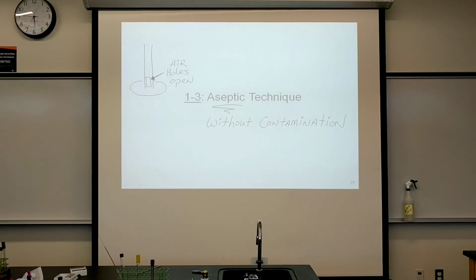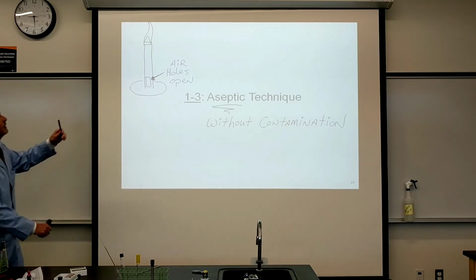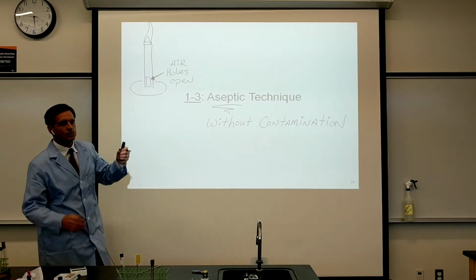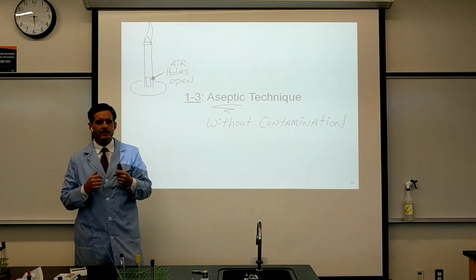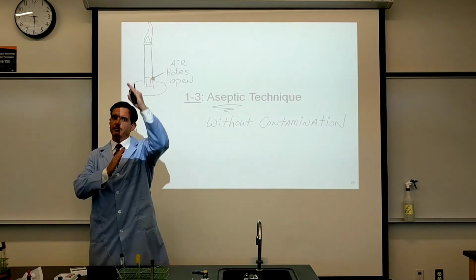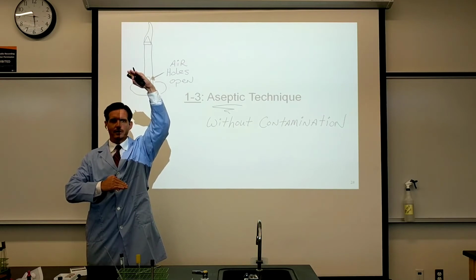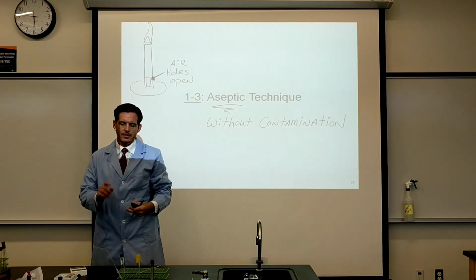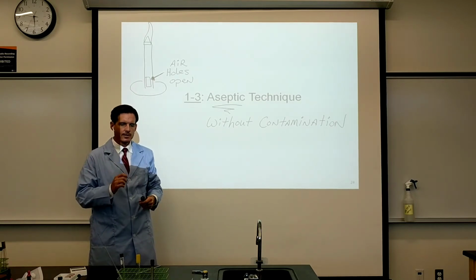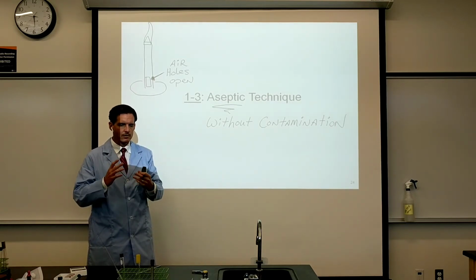When your Bunsen burner is lit, up here at the top where the gas comes out, the flame will have 2 parts to it. The part of the flame that has this central inner triangular sharp cone has to be there. If the air holes are closed, that part goes away and the flame gets taller and softer and actually not as hot. If you have the air holes open and everything adjusted properly, the gas pressure, you don't want to have it too high or too low or it'll blow out.